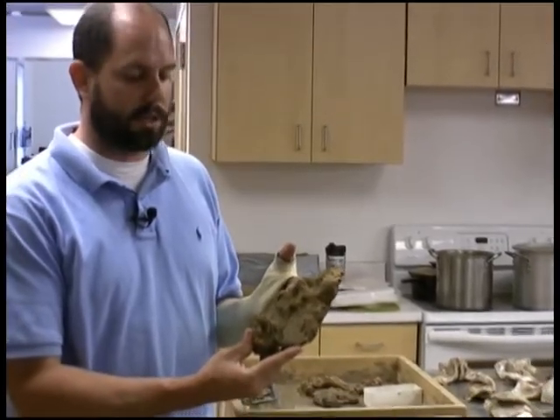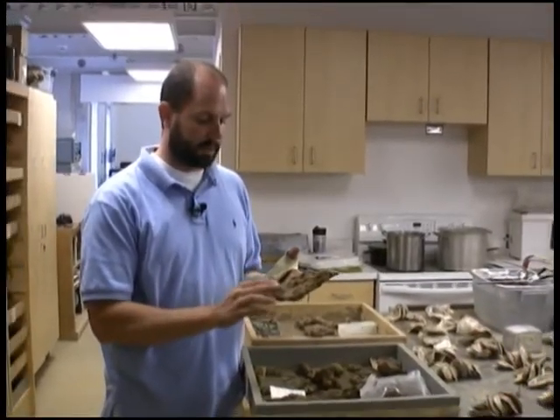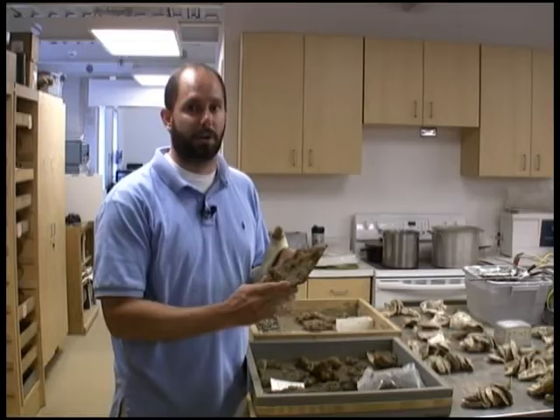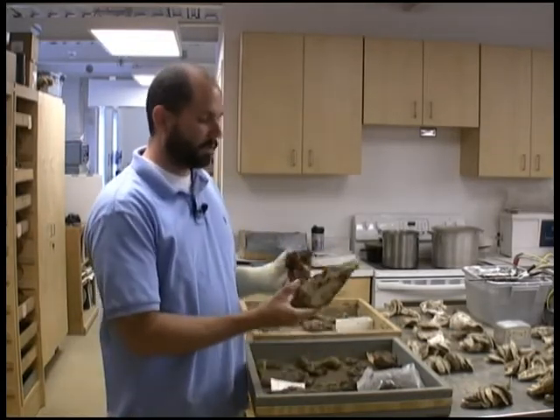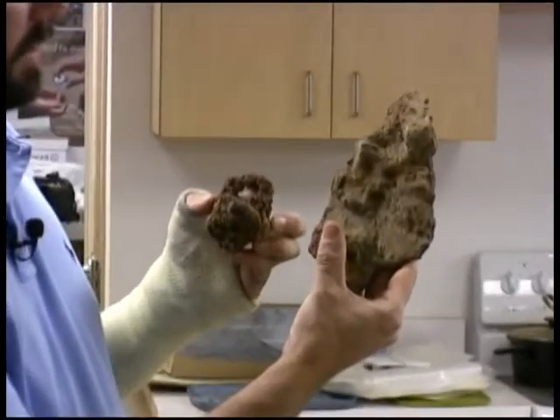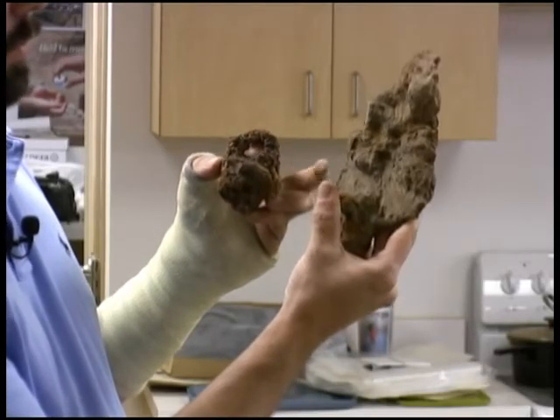Chlorides in combination with oxygen in the air and water vapor on iron will cause rust. One of the jobs of the conservator is not to inflict any more damage to the artifacts, so we definitely don't want to introduce any more chlorides to an already rusting artifact. I'm holding two artifacts here — a mason's trowel in my right hand that has not been washed yet, and a ball lock in my left hand.